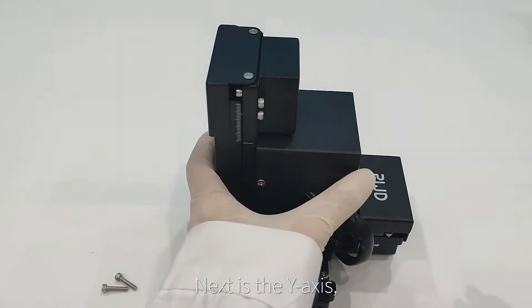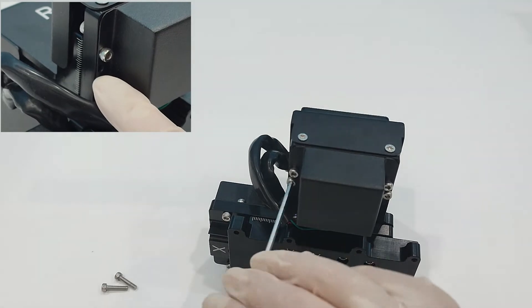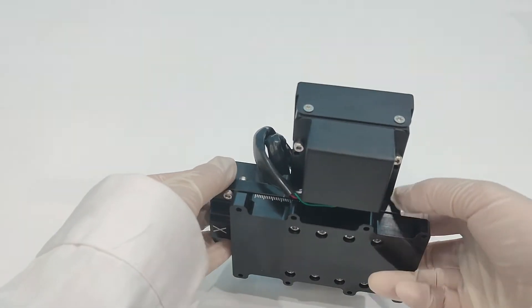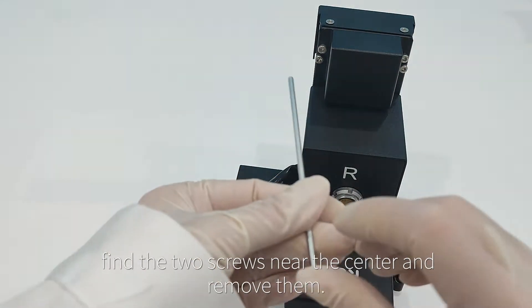Next is the Y axis, which requires flipping to find the two screws near the center and removing them. Finally, for the Z axis, find the two screws near the center and remove them. Now all three axes can move normally.